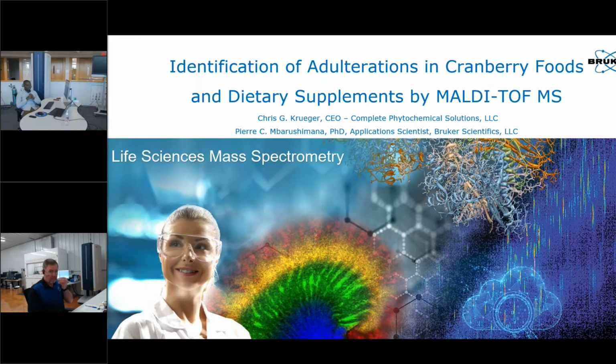But today we will be showing you live how MALDI-TOF mass spec is used for the identification of adulterated cranberry foods and dietary supplements. So today I'm here with Chris, who is the CEO of Complete Phytochemical Solutions. And he will be taking over in just a few minutes, live from his lab in Madison as well, and show you the workflow in action. He'll have a couple of samples to go through with the presentation as well.